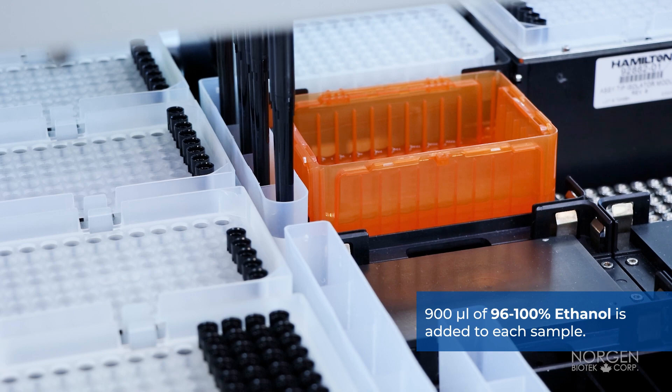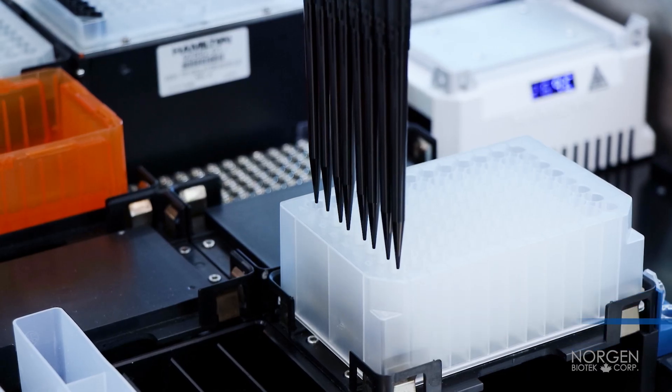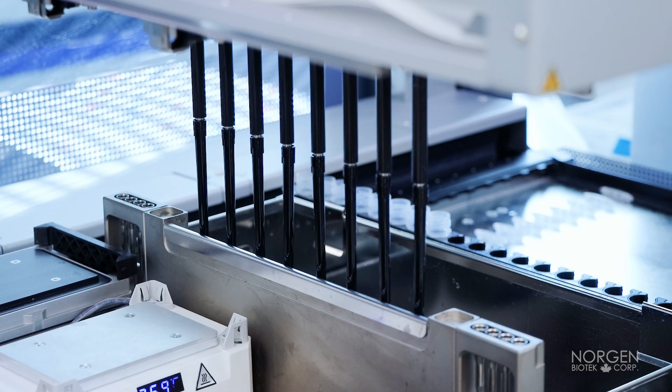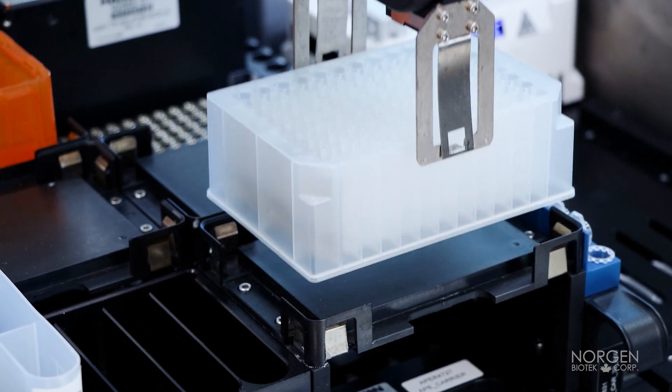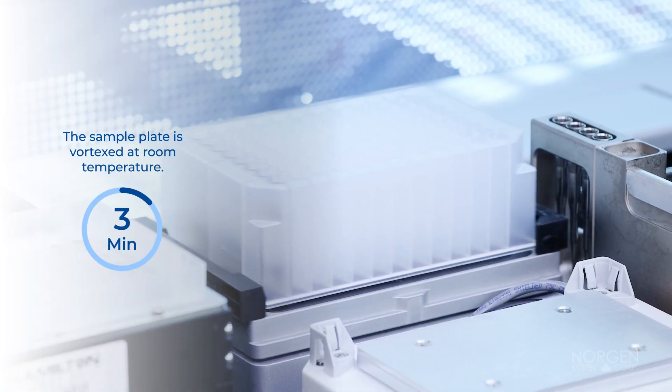900 microliters of 96-100% ethanol is added to each sample in the sample plate. The sample plate is transferred to the heater shaker and vortexed for 10 minutes at room temperature.